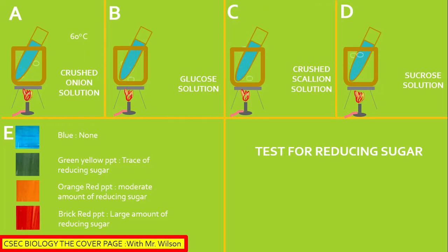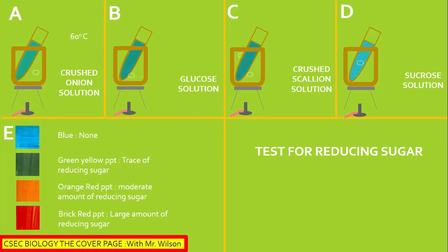We can turn off the flame now. To the bottom left of the screen you would observe blue — the blue suggests that there is no reducing sugar evident. Green, yellow-green, or dark green, as you are seeing on the screen now, indicates a trace of reducing sugar.